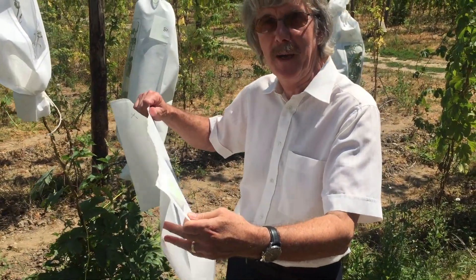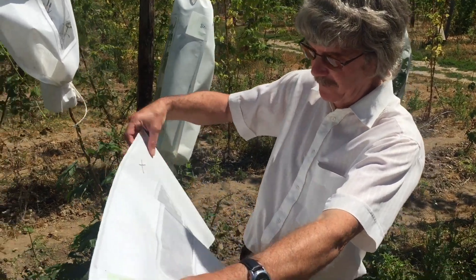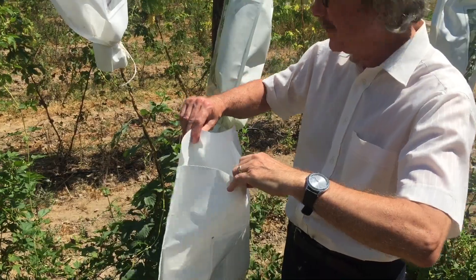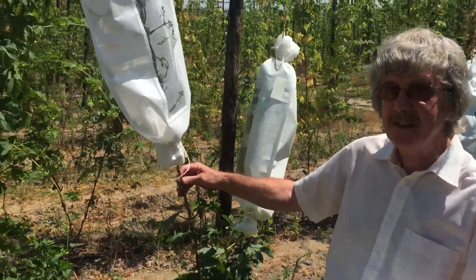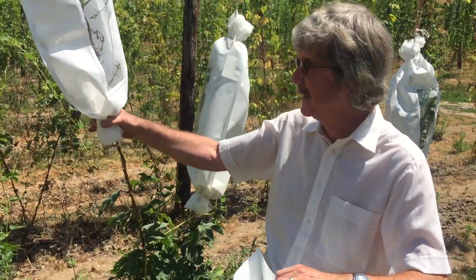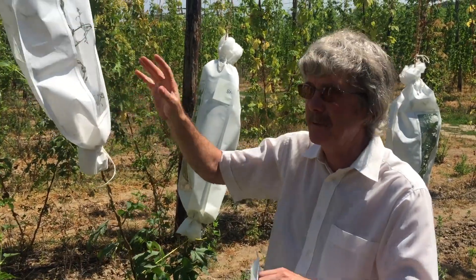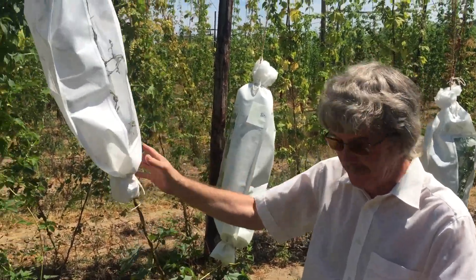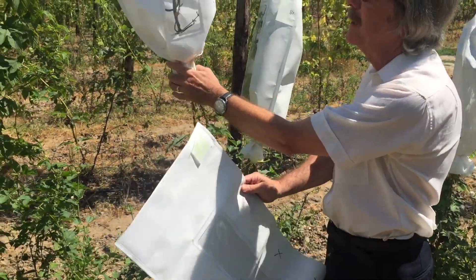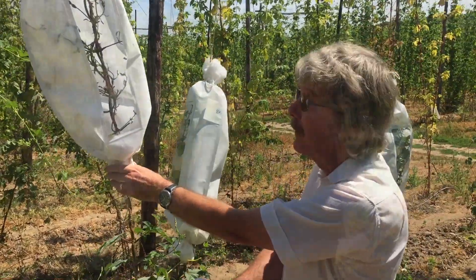These bags from PBS are bespoke bags — made specially for us to the dimensions we want with the window that we want. The size is deliberately chosen so that we can get it onto these vines. If they were any bigger there would be too much to gather together to seal; if any smaller, there wouldn't be enough room for the plant inside without getting too full of leaf. So they are the optimum size, with a window so we can see what is happening and know when to introduce the pollen.